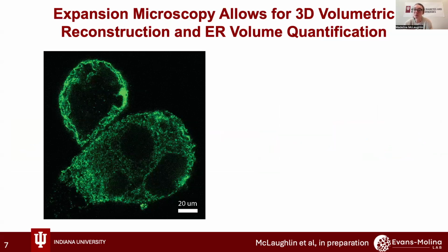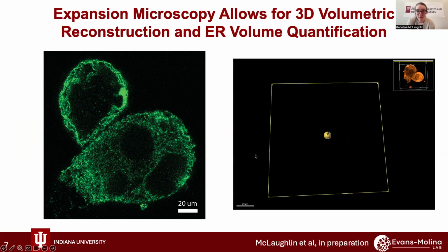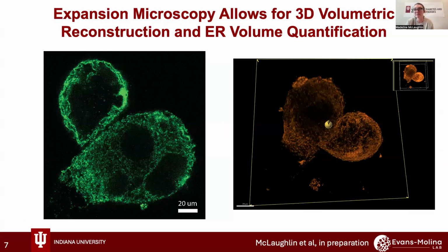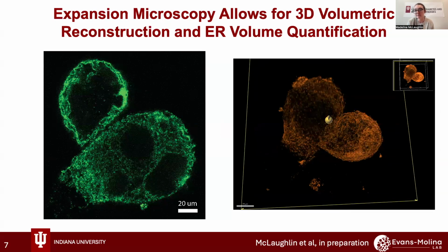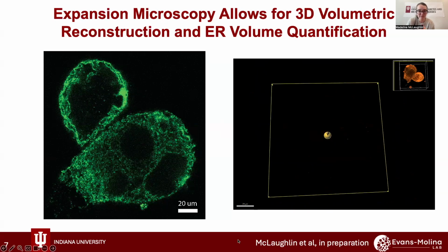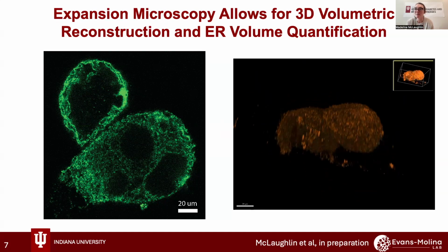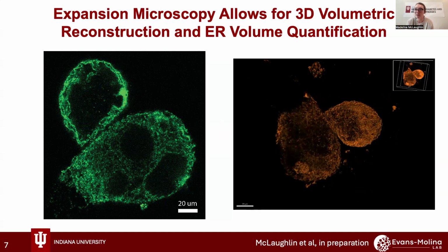We were able to get the 3D rendering of the cell by putting all of those Z slices together in Imaris, and we have found it best to perform a median filter to help get rid of the noise and background and make the overall signal clearer. So here on the right, we have a 3D rendering after the median filter is applied, and it goes through all of the different stacks, and it builds it up so you can see the whole cell here. And next, I just have a 3D rotation of the entire cell processed together so you can see that 3D volume.